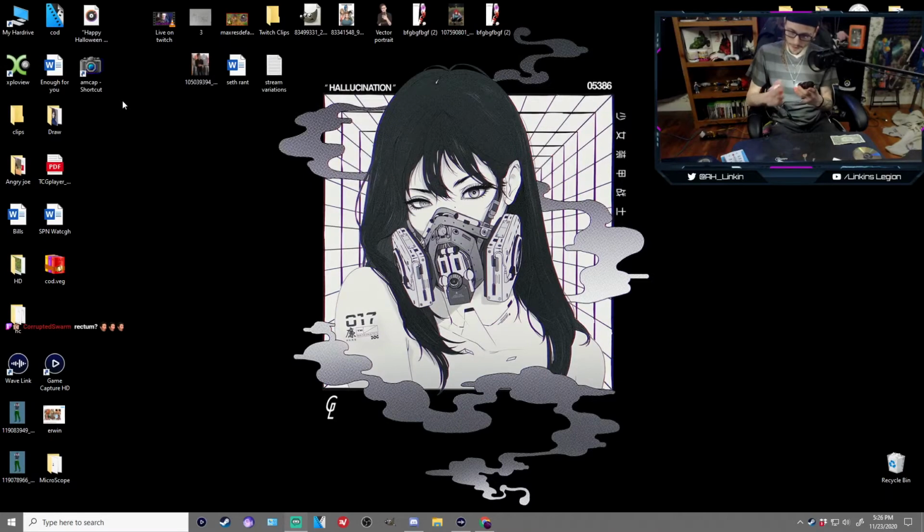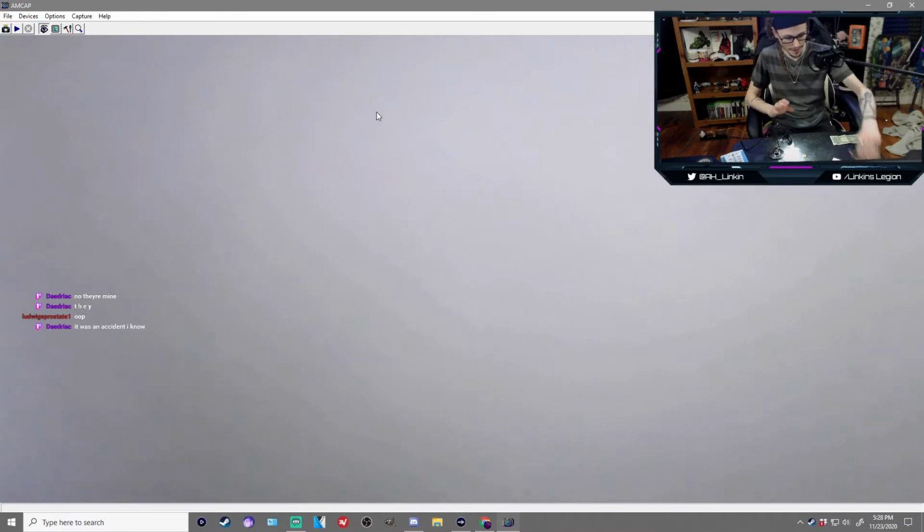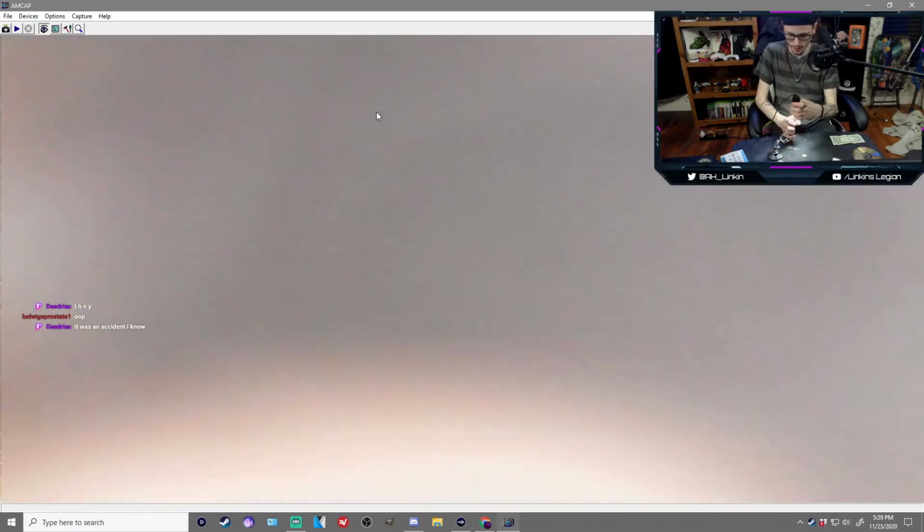So, by the way, if you guys are wondering about the zoom of it, it just closed out on me again. It goes from 40 times all the way to 1,000 times. And I've got so many things. I'm gonna look inside of my iPod charging port.